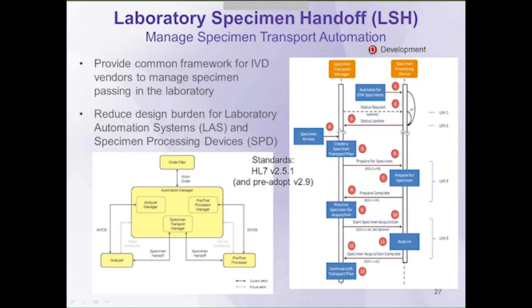And so there is a clear need for a fully specified interface to reduce the time and cost associated with managing these specimen handoffs in clinical laboratories today. And it's our hope that this laboratory specimen handoff profile, which is in development, will provide the standardized workflows for the most common use cases. And you see some depictions of what's involved there.